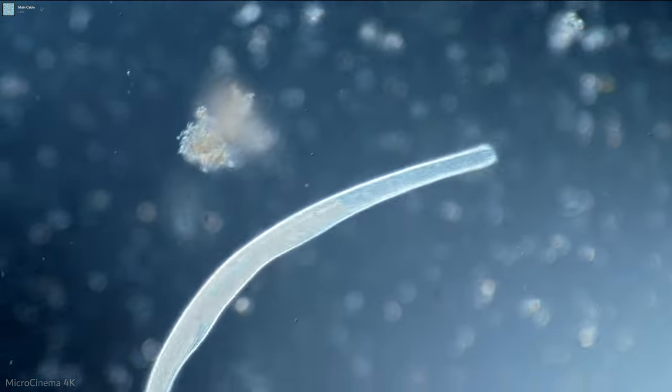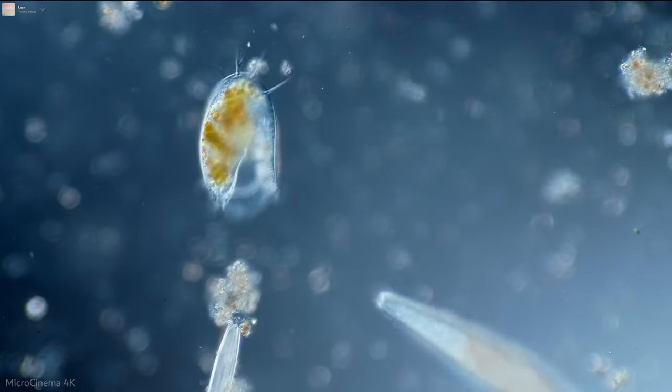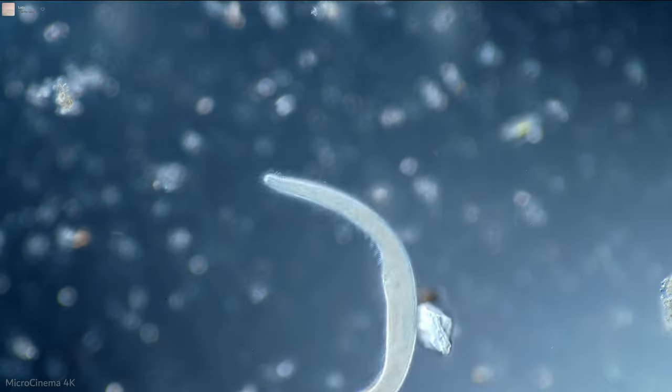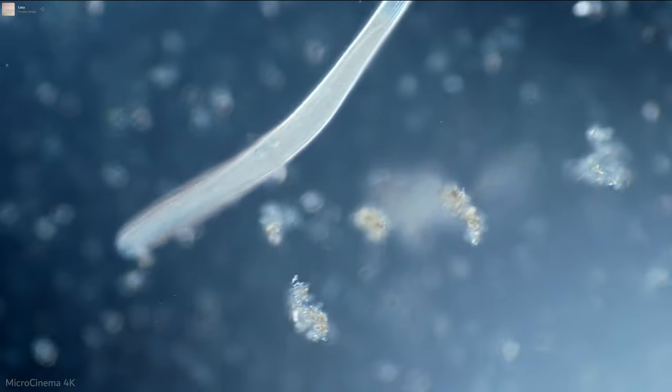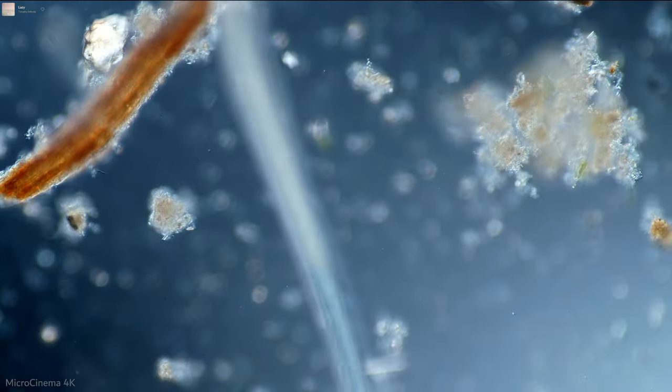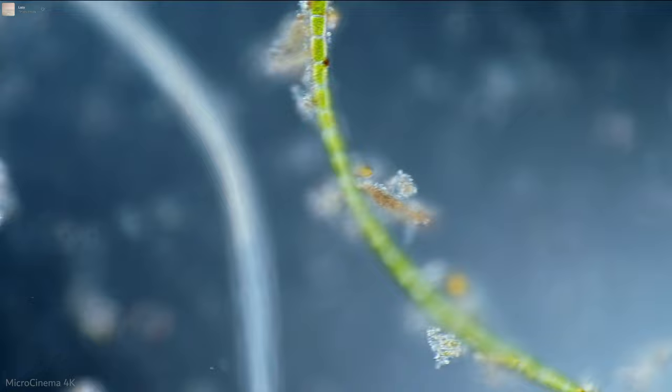So you generally find them, there's our Euplotes again. Oh, did it just contract there? I think I saw it contract. So these I typically find associated with sediment. And a lot of critters that you find in the sediment are long and narrow, so that they can kind of weave through the sand grains and whatnot. But I think that's the general idea with Spirostomum as well.